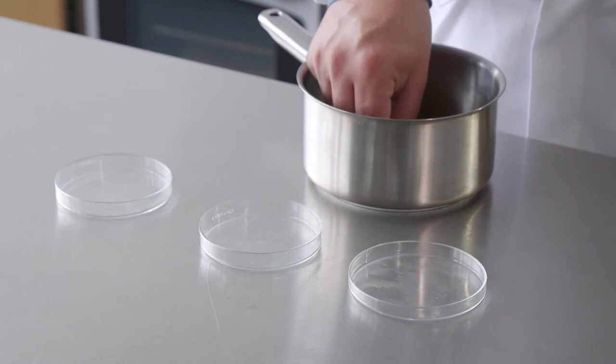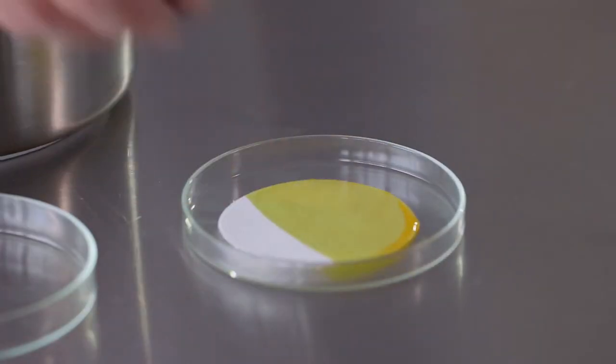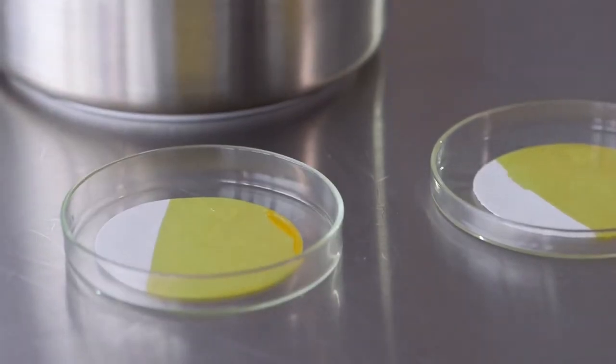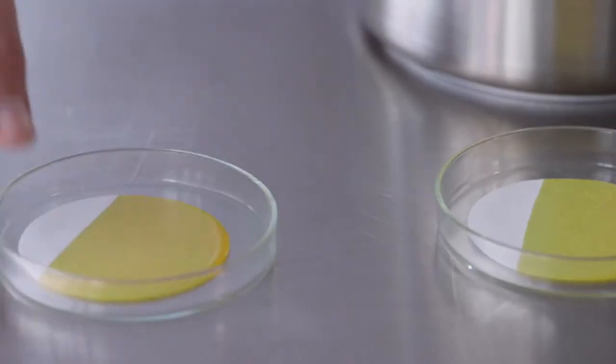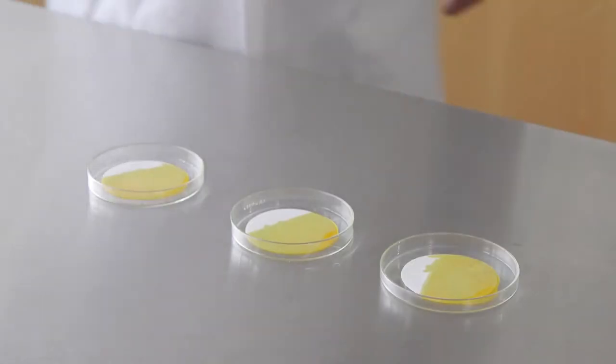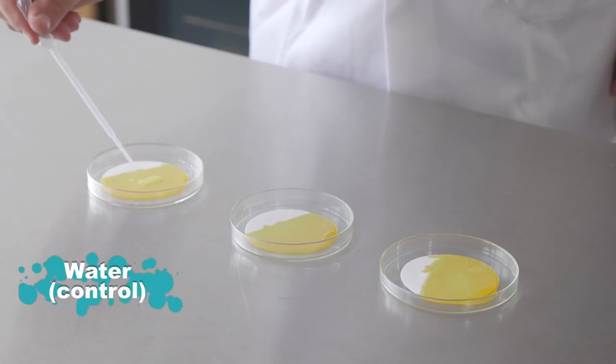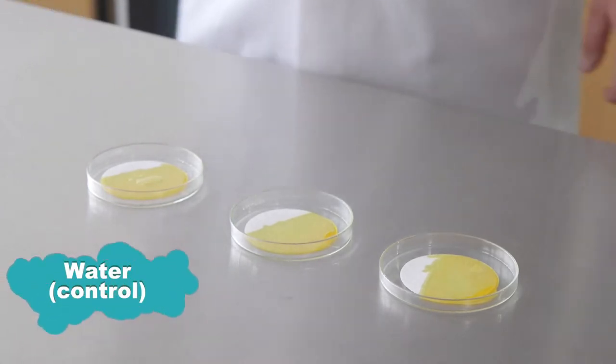Leave these where they are for four to five days. The second experiment will look at the effect of chemicals on this process. As before, prepare some discs of beta-carotene colored fat and place them in petri dishes. This time, treat the dishes as follows. One, just with water, which is our control.